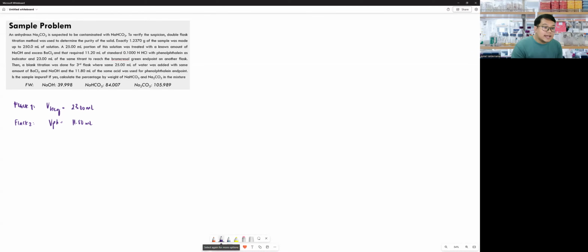So our TBS is equal to N HCl times VBCG, which is also equal to the equivalence of bicarb and the equivalence of carbonate. Okay? So our N is 0.1. The volume that we used is 23.